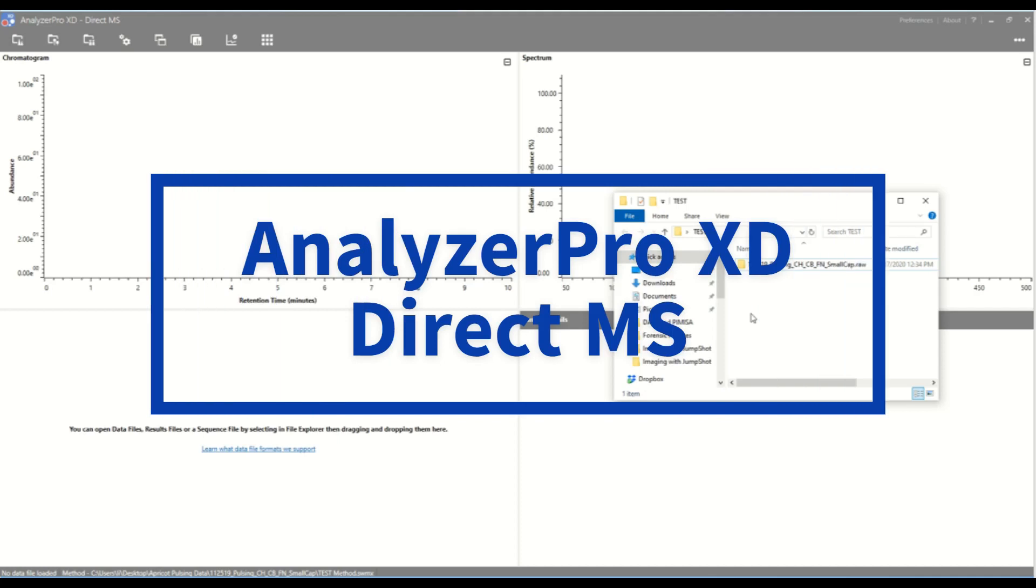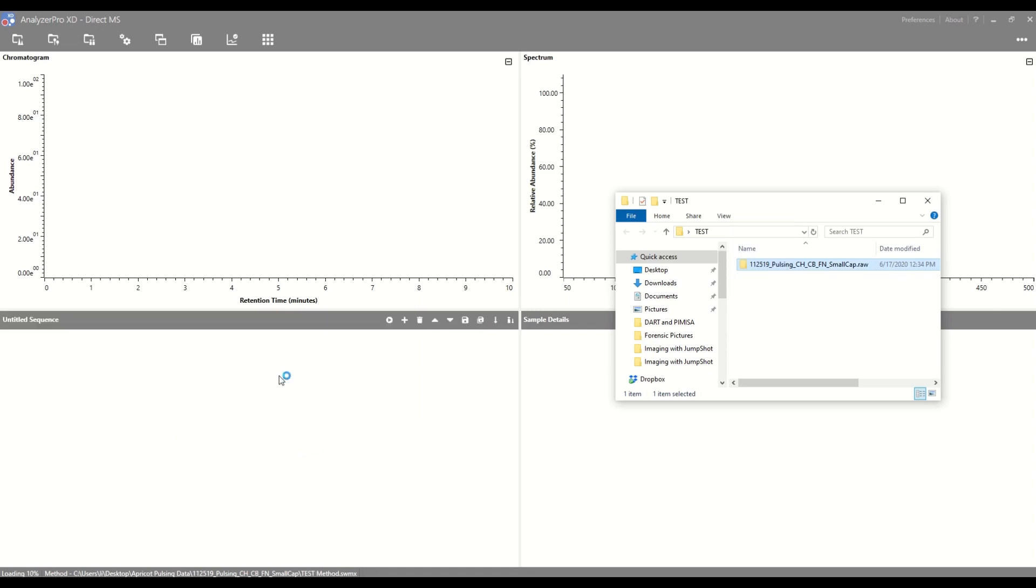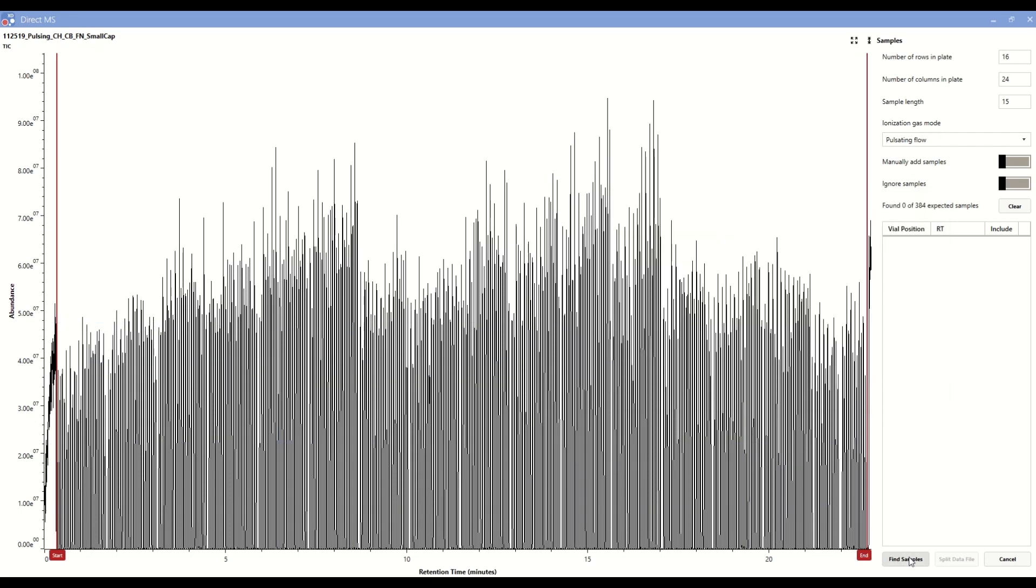Our post-acquisition software Analyzer Pro XD completes the workflow in just a few extra minutes. Simply drag and drop your data file into Analyzer Pro and load the TIC of 96 or in this case 384 samples.